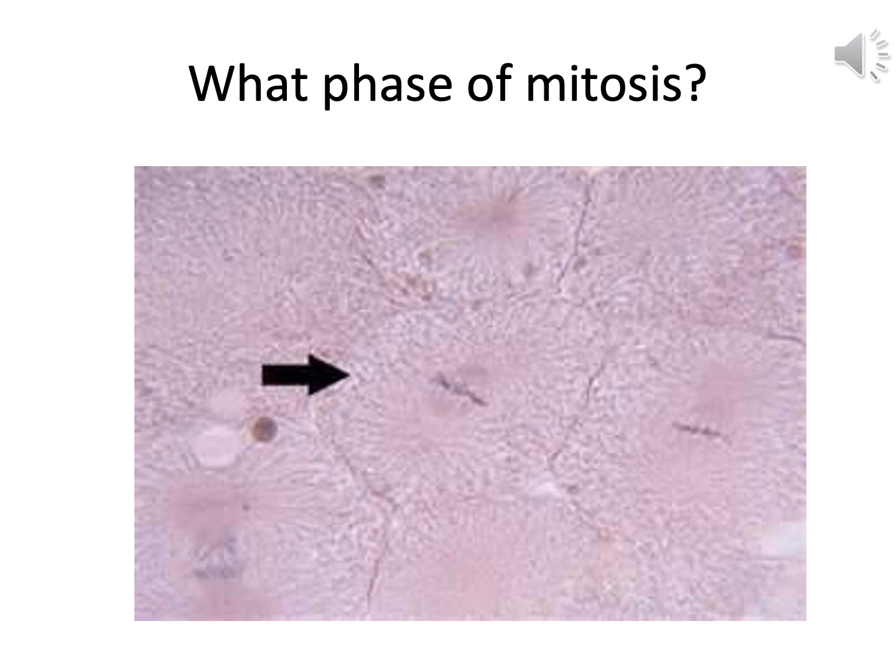How about the cell to the left and underneath? That one's a little harder. It's a blurry picture. It's not the greatest picture, but it is anaphase. The chromosomes are starting to pull apart kind of top and bottom. Any of the rest of the cells, I'm going to say, are just in interphase. You can't even see the blob for the nucleus for prophase.